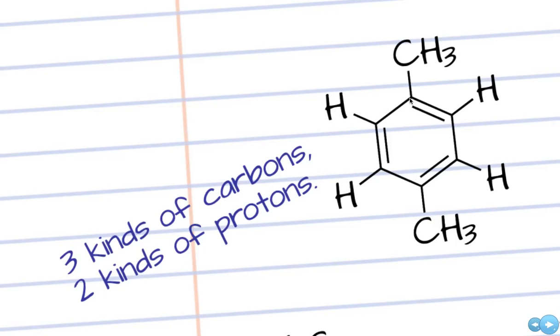The chemical shifts, or the parts per million, for the carbon 13 NMR also tell you exactly what's going on. So once you've decided that this is your candidate, I can go to the proton NMR and confirm by the chemical shifts, or the numbers that you're seeing for those peaks. You can confirm that this is indeed the structure. For the carbon 13, you can actually calculate what the chemical shifts should be and model that against your data, and you will see that they fit very closely, and therefore this is likely the correct structure.